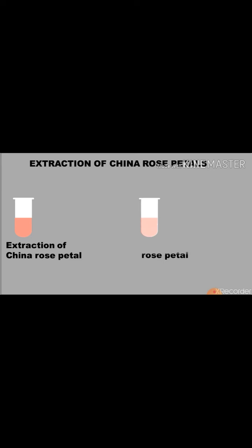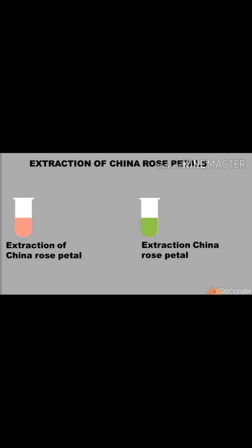Take another test tube half-filled with extraction of China rose petals. Now add few drops of base. We will notice green color will appear. It means in the presence of base, the extraction of China rose petals changes into green color. So we can say extraction of China rose petals can be used as an indicator for both acid and base.